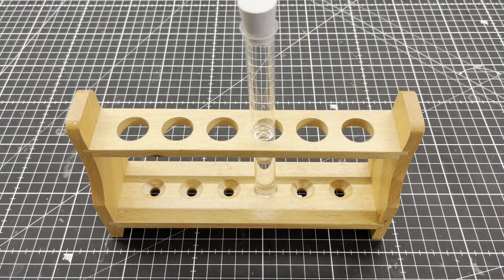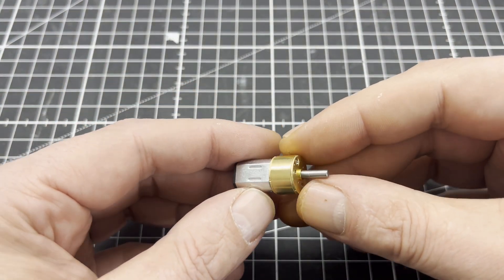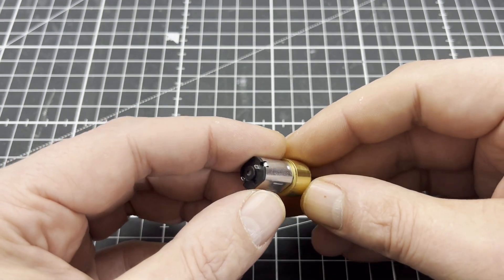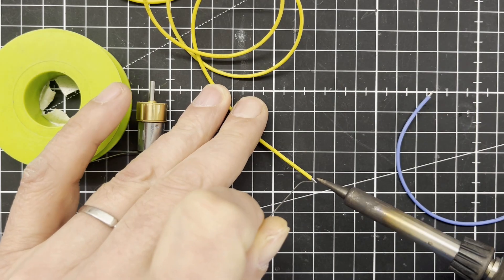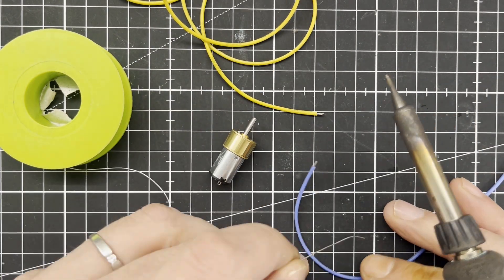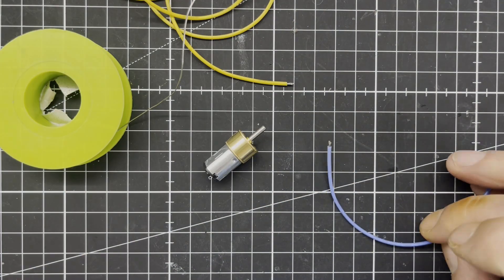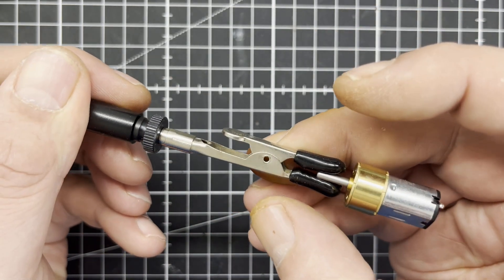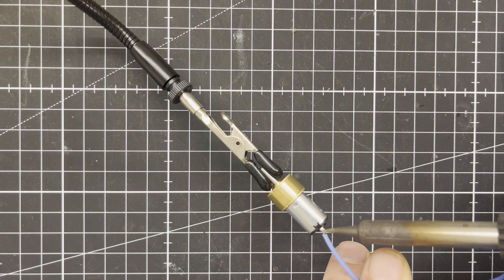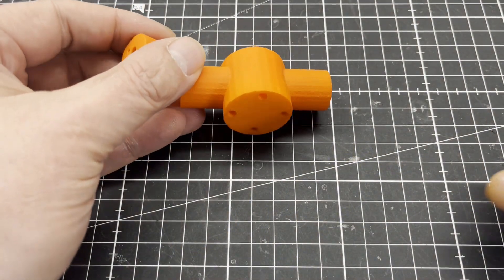It is clear that at least a micro-scale chemist needs an overhead stirrer for test tubes, so we build one. That's a micro geared motor with a rated voltage of 6 volts and 600 rpm. Only three 3D printed parts are needed for the stirrer.